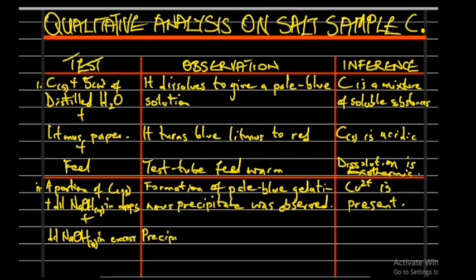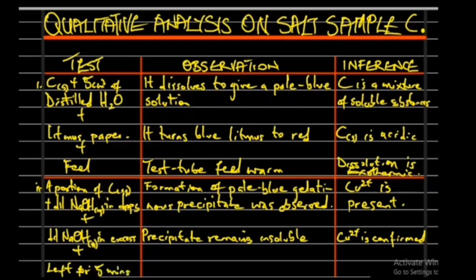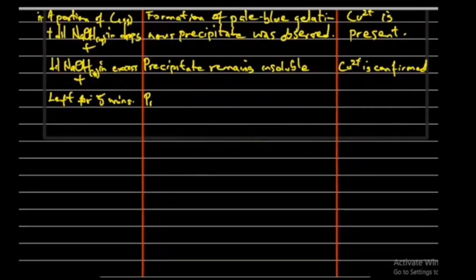The precipitate that was formed earlier remains insoluble, and this confirmed to us the presence of Cu2+. Also, when we left it for 5 minutes, we discovered that the precipitate turned brown-red.